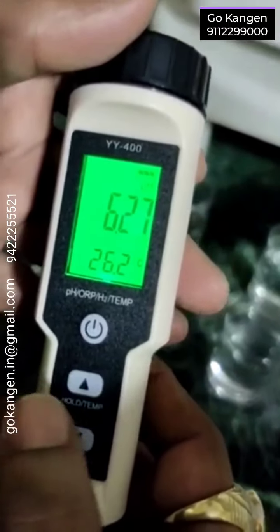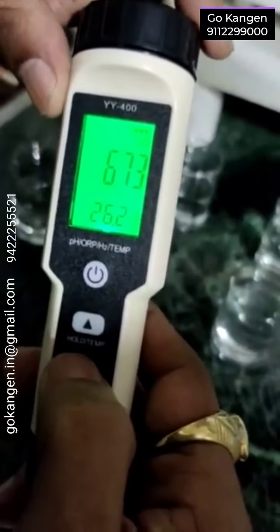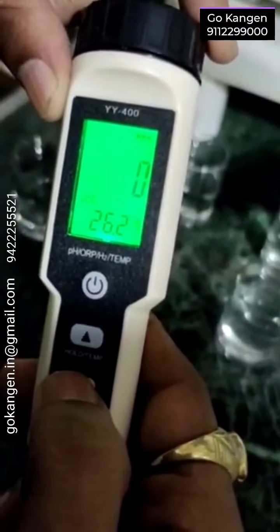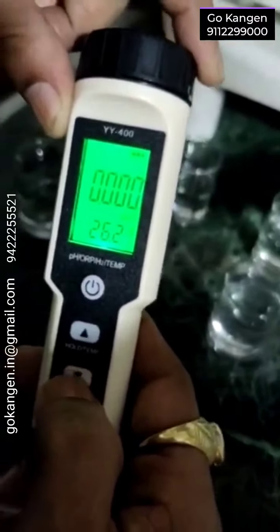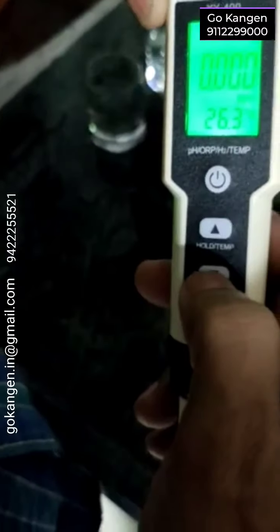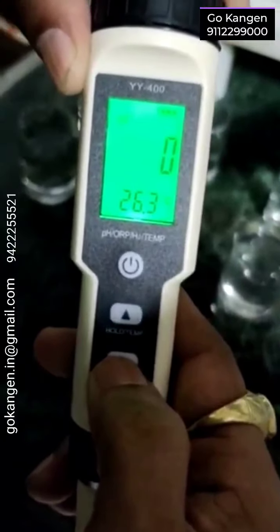I will first show you the functionality. Right now this is at pH. Now this one is PPB — hydrogen. This is PPM, parts per million, hydrogen. And this is ORP.